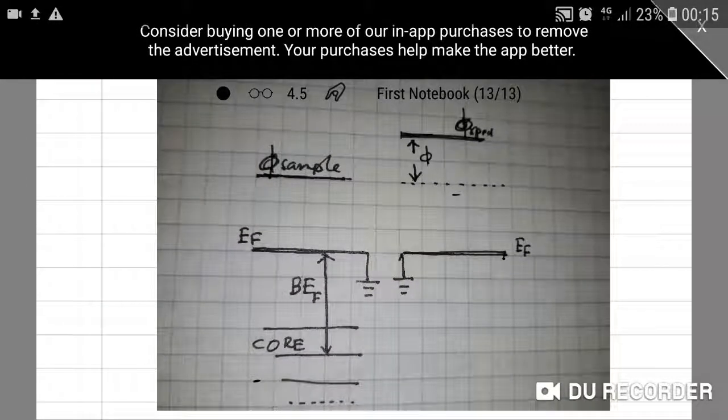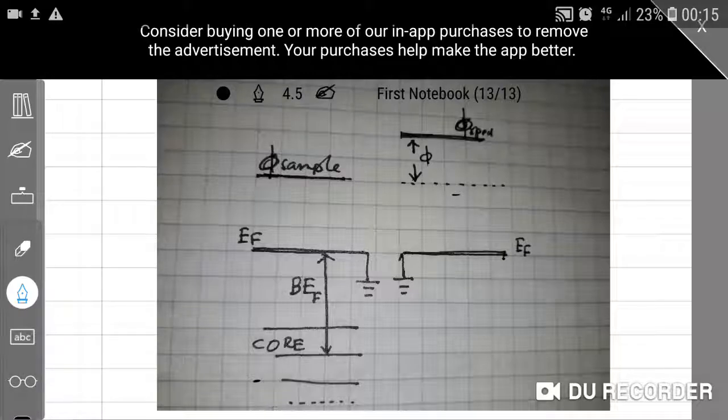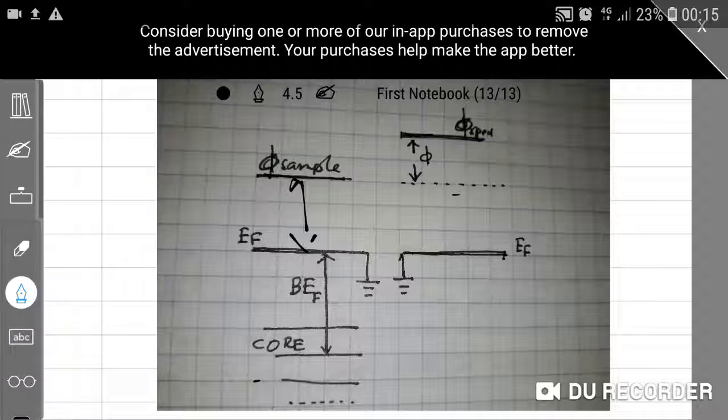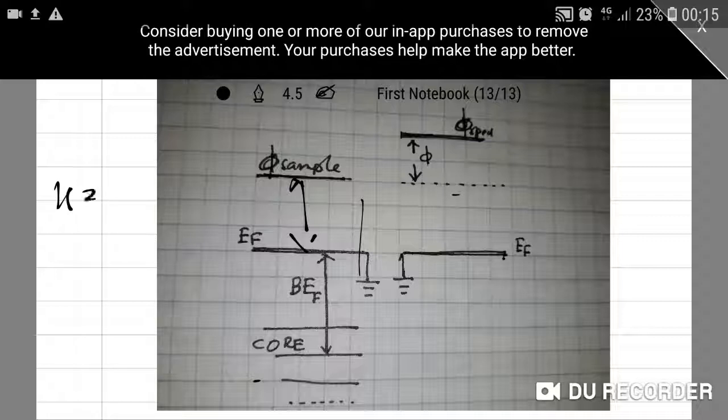This is the energy diagram of a sample and a detector. When electrons are ejected by X-ray photons, they come to the Fermi energy, and then they become free after crossing this work function, and so they get the kinetic energy that equals h nu minus binding energy minus phi of sample.